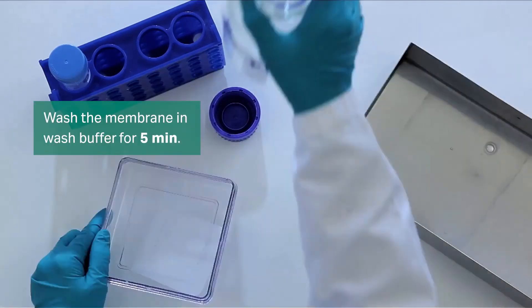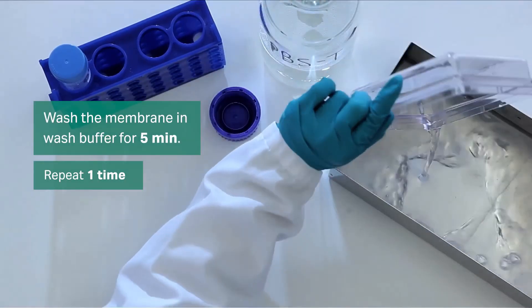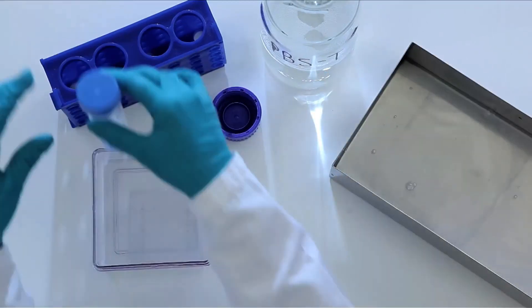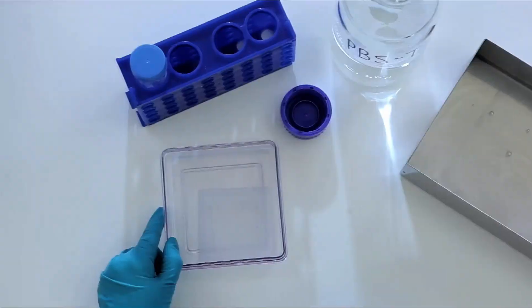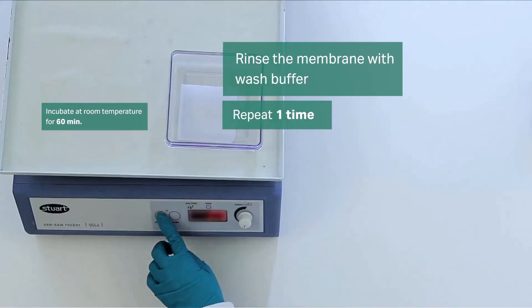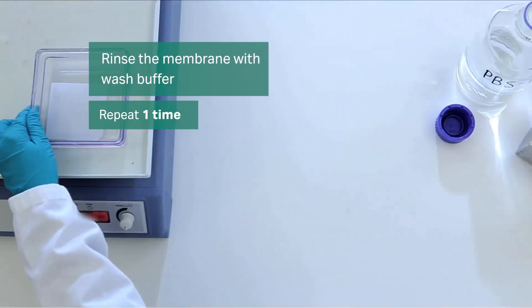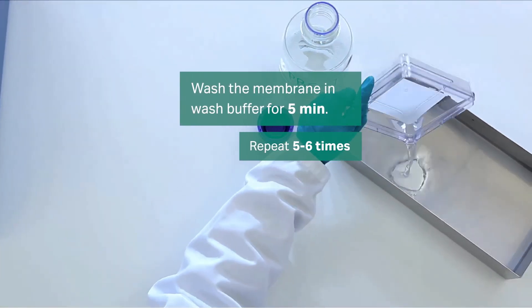Next, wash the membrane in wash buffer for 5 minutes. Repeat once more. Add the primary antibody diluted in PBST to the membrane, then incubate on the rocking table for 1 hour at room temperature. Rinse the membrane twice with wash buffer, then wash in wash buffer for 5 minutes. Repeat 5 or 6 times.